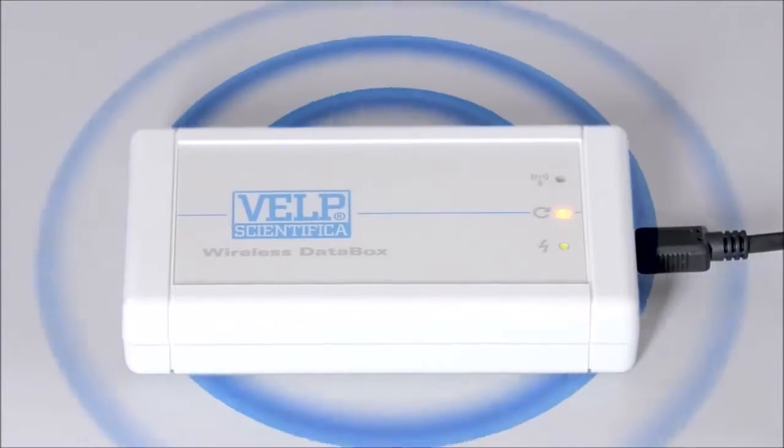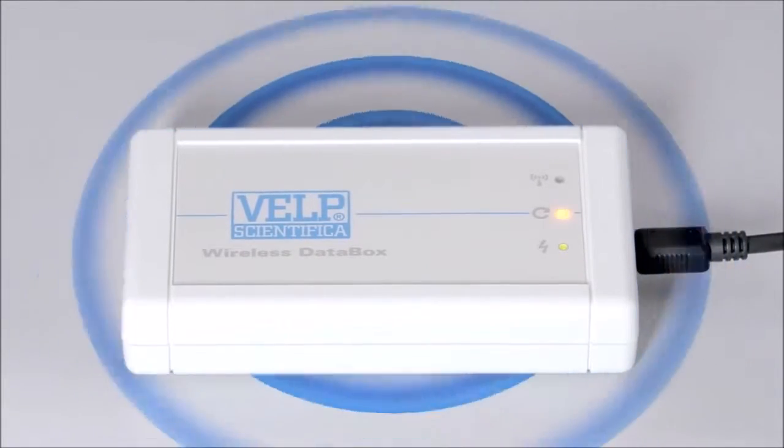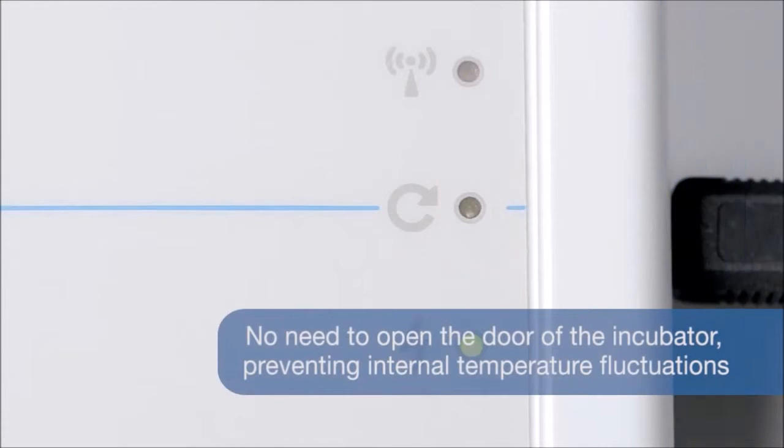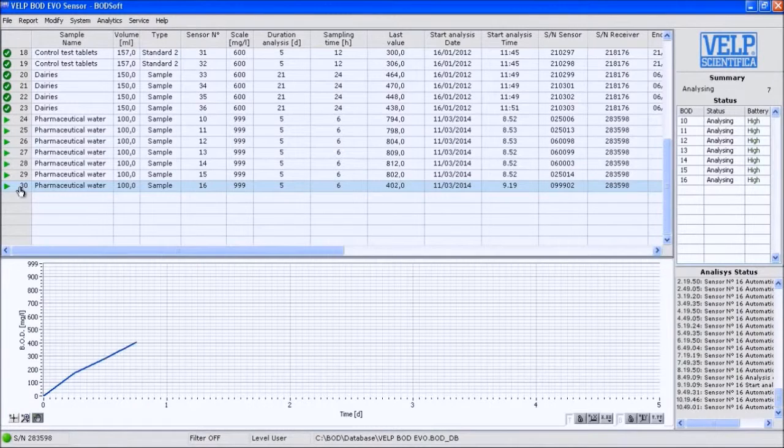BOD Evo Sensor ensures an outstanding reliability as there is no need to open the door of the incubator for data monitoring. There is no risk of internal temperature variation during the test.